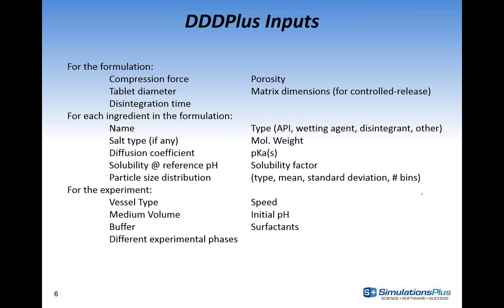We've added the ADMET predictor module into DDDPlus version 5 that allows you to define these simply with structure using our QSAR models. We don't have in vitro data available.